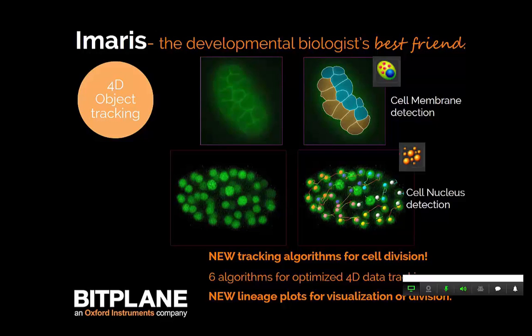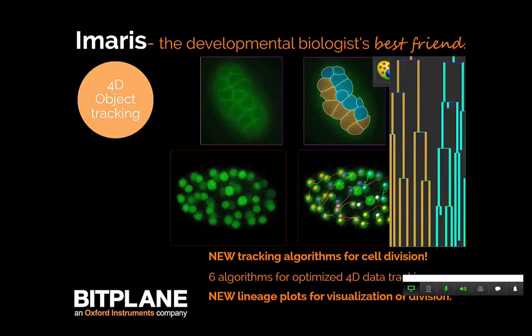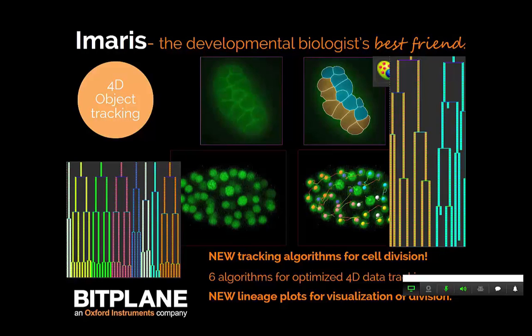Last but not least, in our December release of Imaris 8.2, we also implemented lineage plots. So this is now part of our track editor, and you'll see that this is a lineage plot for the data set at the top. And you'll see that the labeling that we've applied for each of the tracked cell divisions is also apparent in the lineage plot. And we also have another one here showing you the labeling being applied to each of those parent cells and the resultant daughter cells.